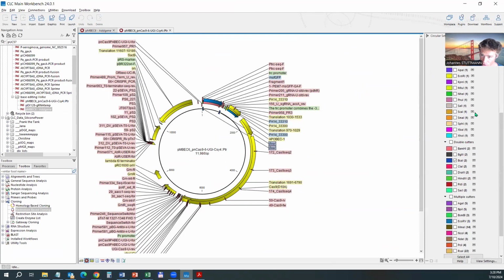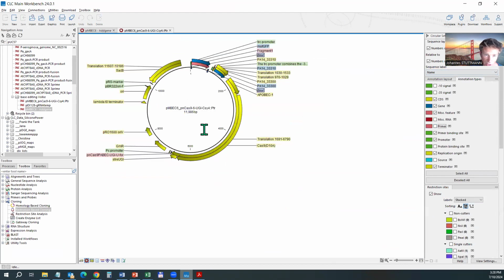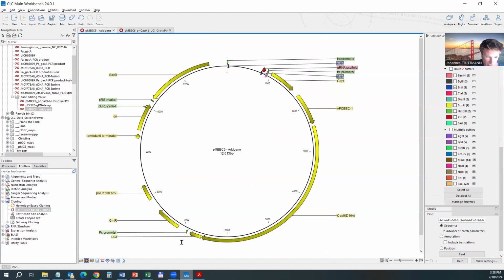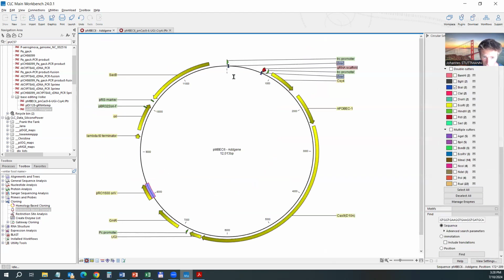So this one has most importantly a number of oligonucleotides, which of course is not bad at all, but still. So let's quickly go through the features of this. So we have a gentamicin resistance here. This is for positive selection of transformed bacteria. We have a first origin of replication for E. coli, so a high copy number origin of replication, and a second origin of replication for replication in Pseudomonas bacteria. So you see here, it's only this little piece that is annotated, and here as well, no difference.